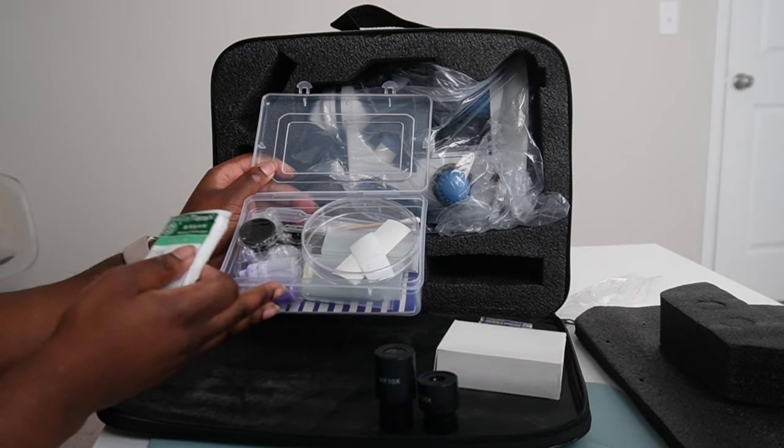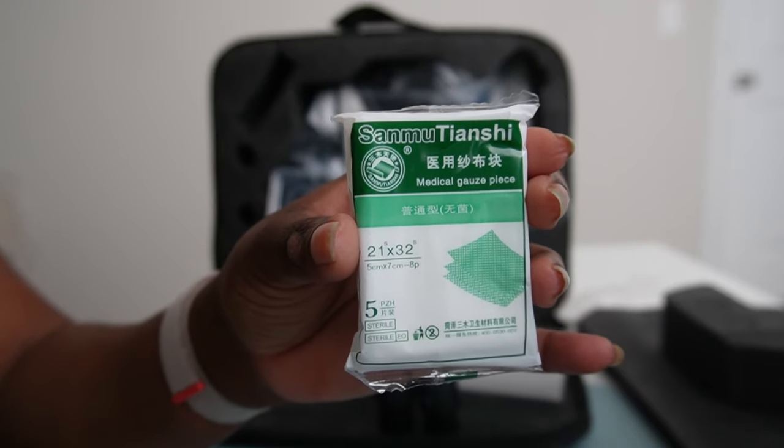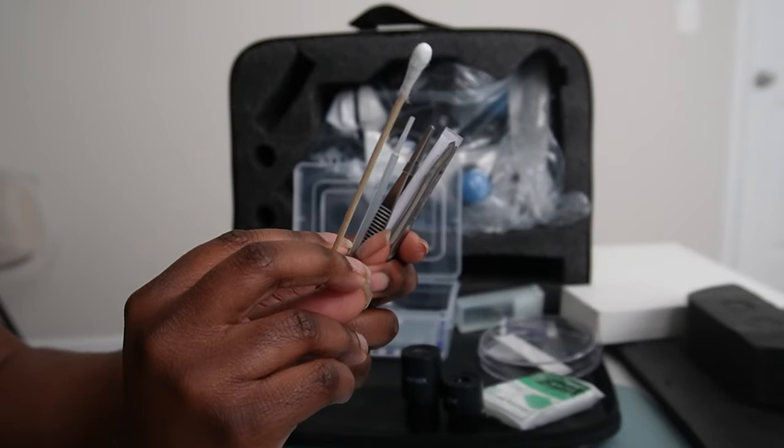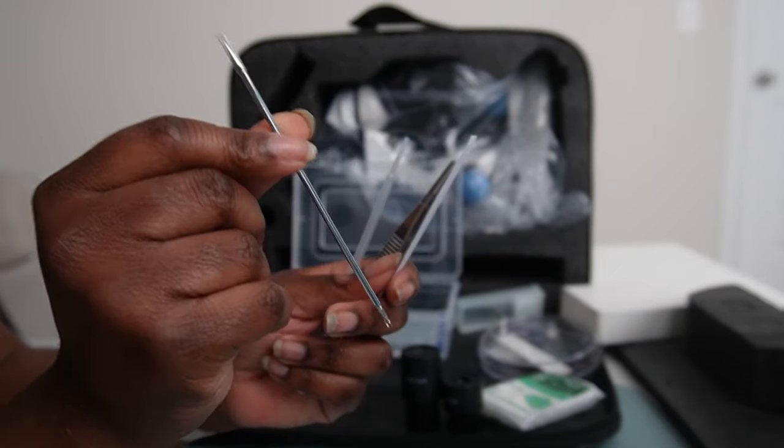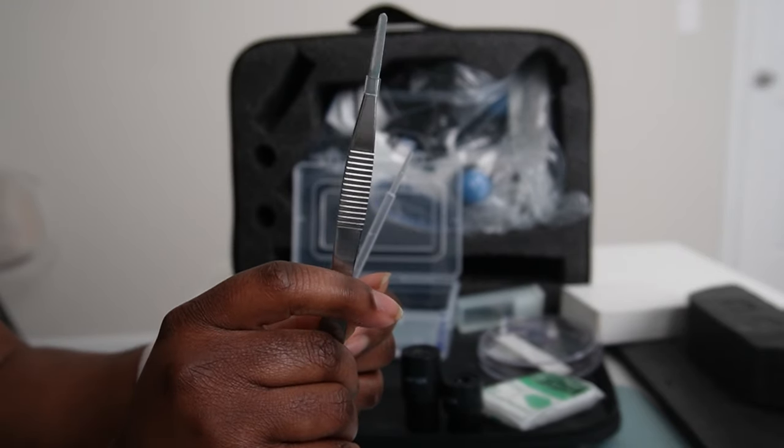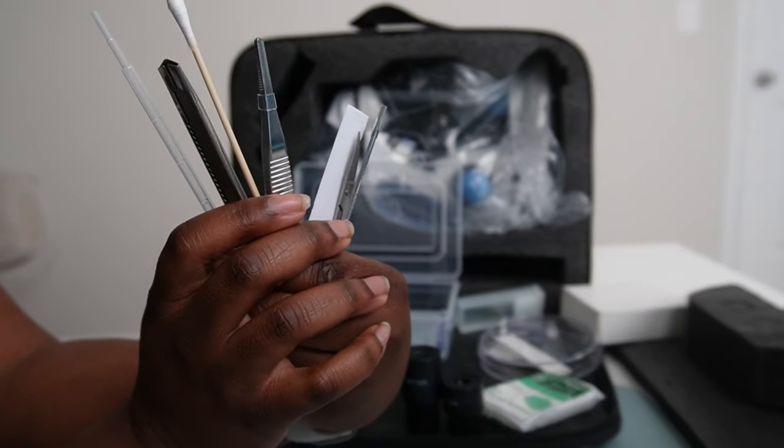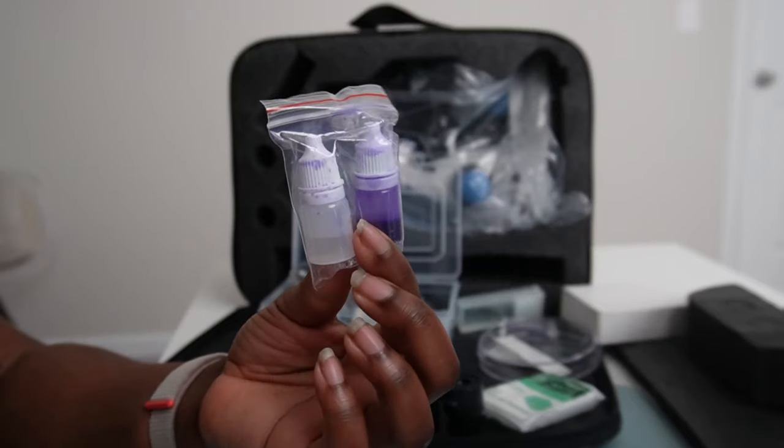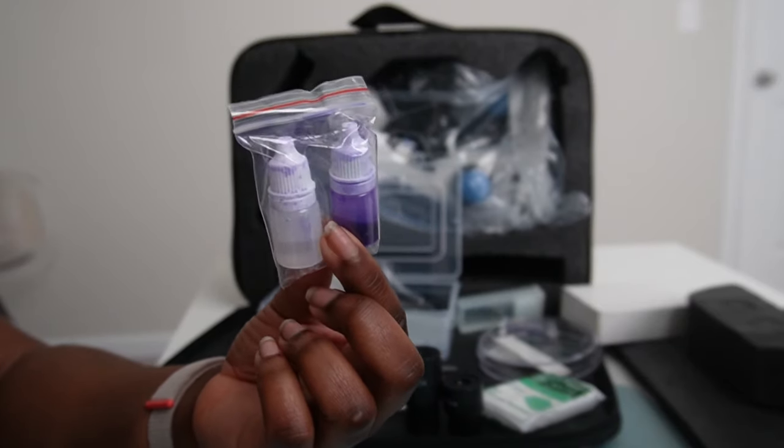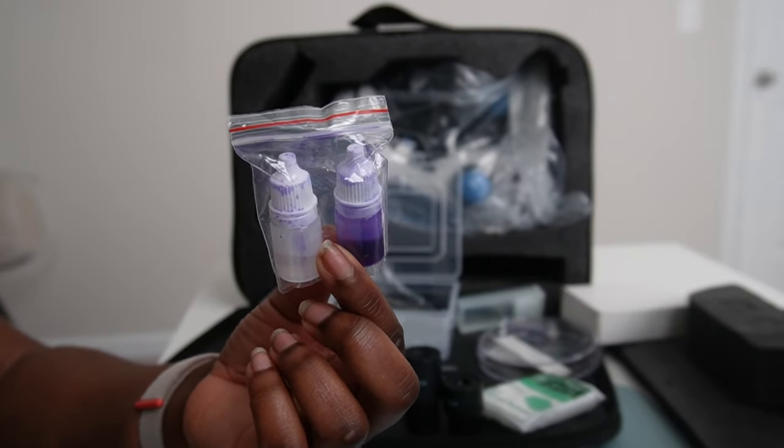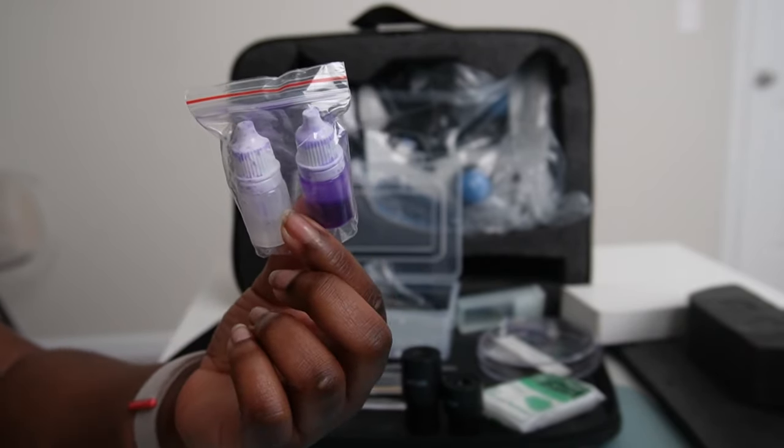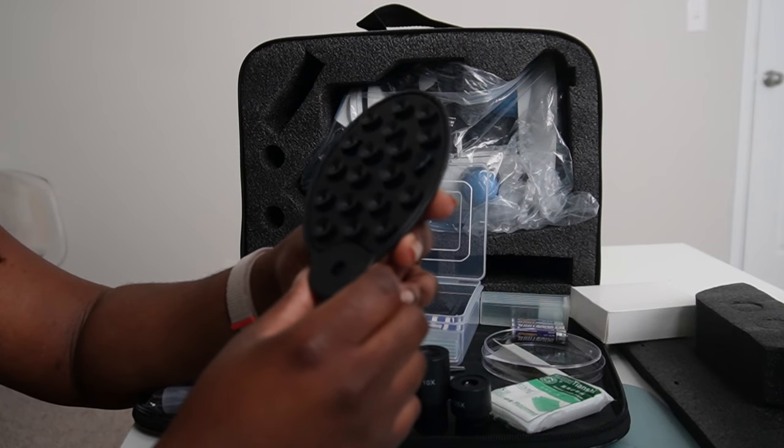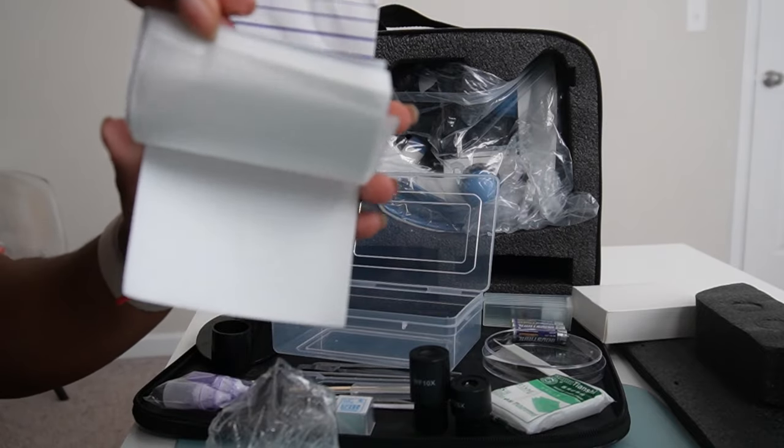Included in the box are also some accessories that come with the kit. It came with some unlabeled liquid. I don't know what this was purposely for, but it's already spilled out in the bag so I probably won't use it. And I guess this is a phone cover and a few sheets of lens paper.